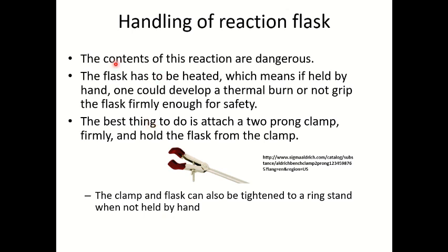The contents of this reaction are dangerous, and since the flask has to be heated, if held by hand, you can develop thermal burns, or the product can be in contact with your skin if you do not handle it properly.